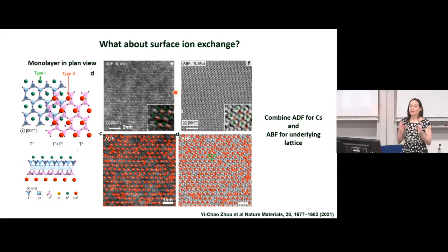Okay, and so we believe that if you could do these experiments in the microscope and really watch what was happening, then you could massively decrease the amount of time it took you to study these types of solution phase reactions, but you could also vastly enhance the value of the electron microscopy to be able to study the differences between different regions of the sample, because that's what we're really interested in with electron microscopy.